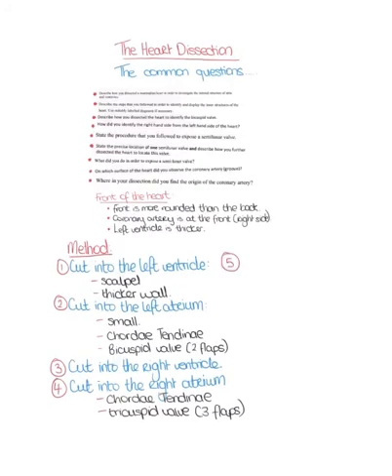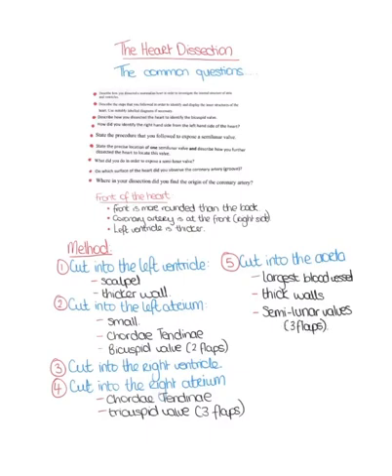The next part of the heart dissection is to cut into the aorta. You know it's the aorta because it's the largest blood vessel in the heart, and you can see quite a thick layer of muscle around it. Cutting into the aorta, you can visualize the semilunar valves, which have three flaps. At the base of the aorta, you can see the coronary artery and where it begins.